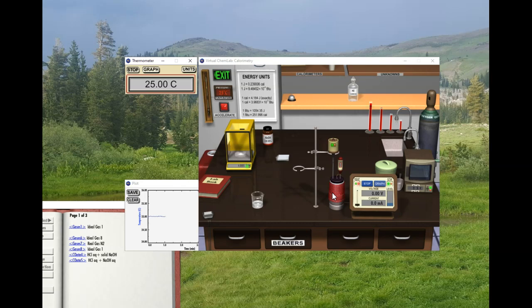We're going to add the hydrochloric acid, and we're going to put it into the calorimeter, and then we're going to make sure the temperature is at the baseline still, and there shouldn't be any temperature change because the calorimeter water and the hydrochloric acid were allowed to equilibrate at room temperature, and we have about 25 degrees, and we're not changing. That's good. Then we're going to take the solid sodium hydroxide and put it into the calorimeter and see what happens to the temperature. Okay, so here we go.